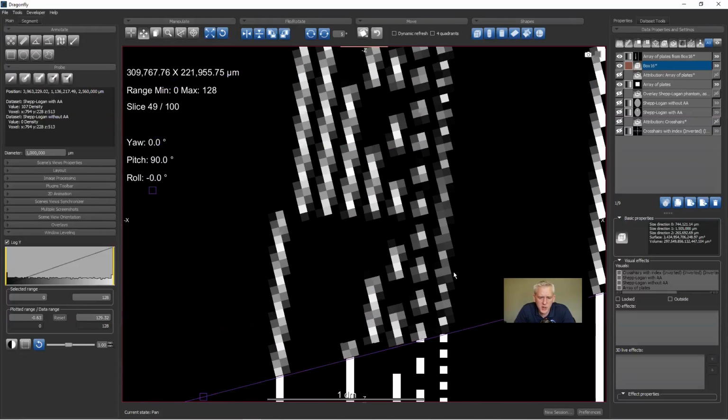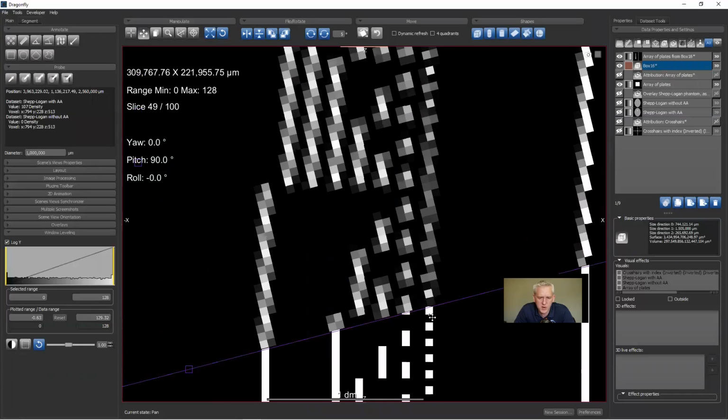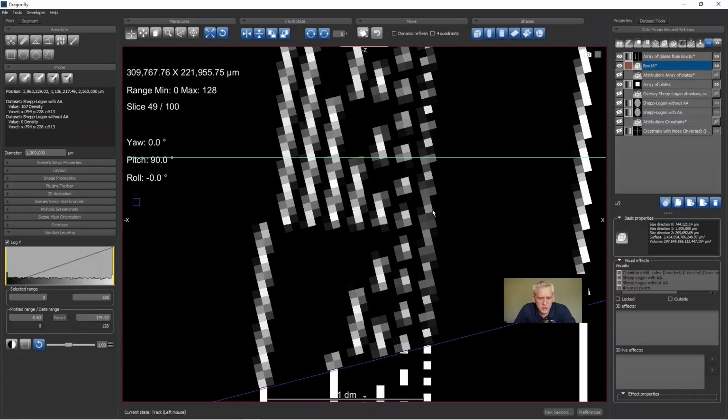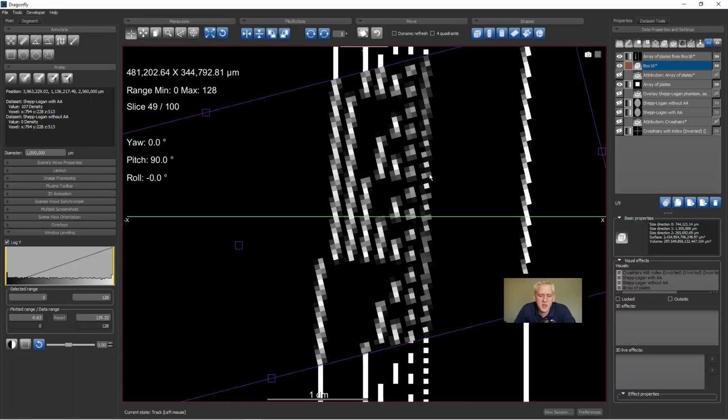But if you were trying to interpret these pixels and trying to reach the conclusion that it's 1 white pixel followed by 1 black pixel followed by 1 white pixel, you really don't have enough information to make a high confidence evaluation there. So the shape information is preserved, but fine details of features that are single pixel thick, you're going to be in very rough shape whenever you introduce interpolation. And so it's very important to know that when you extract structured grid, you can get a very nice oblique crop effect, but you are having to introduce resampling. So that was the whole point of that discussion.